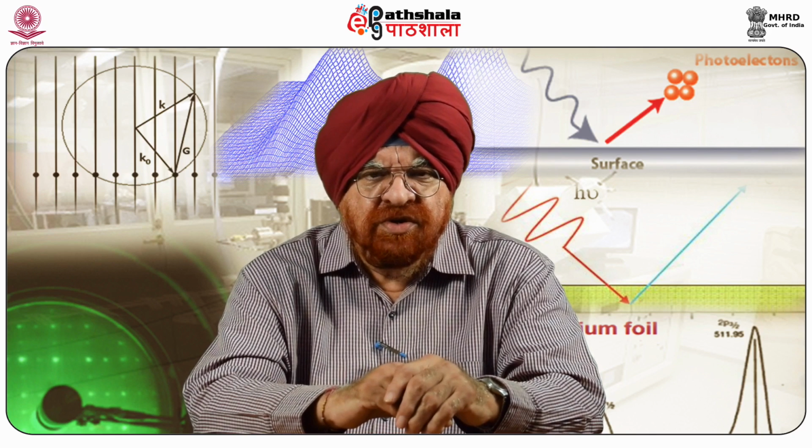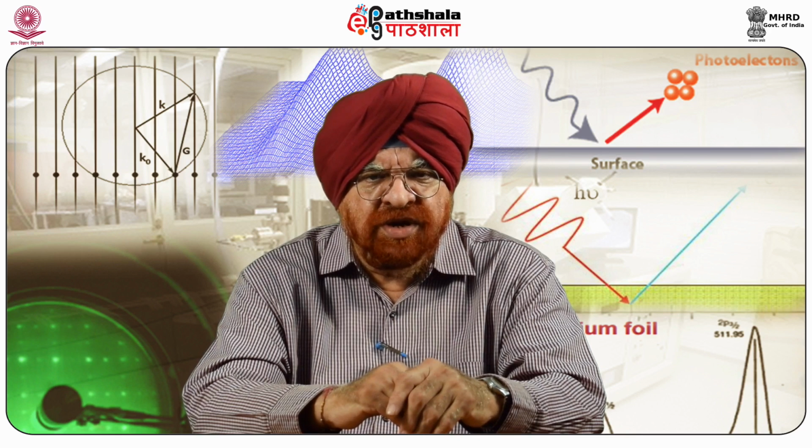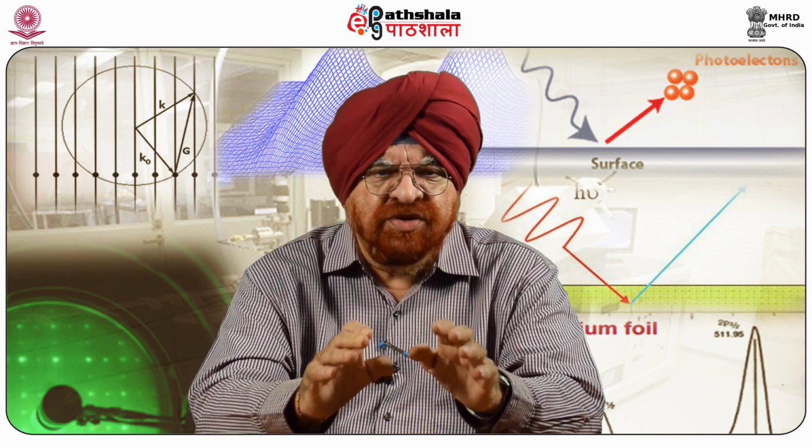MFM can be used to image several magnetic structures, which include domain walls, Bloch and Néel walls, closure domains, recorded magnetic bits, etc. Moreover, motion of domain walls can also be studied in an external magnetic field. MFM images of various substances can be seen in books and journals which have been published regularly. Examples are thin films, nanoparticles, nanowires, permalloy discs, and recording media.